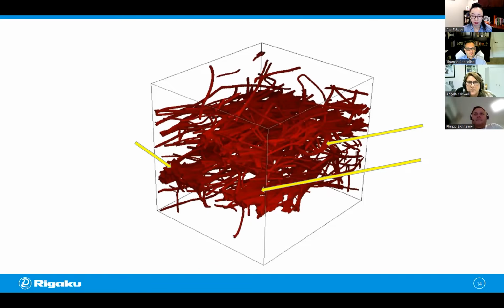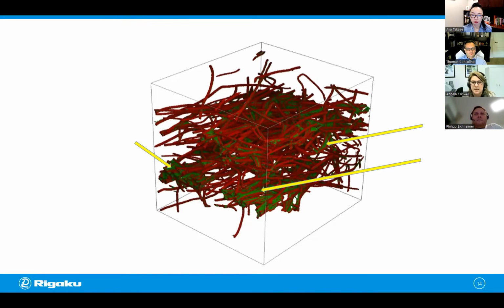So some of these fibers look pretty thick, and it turns out that this thickened area is called binder. And this binder material is often found in fiber media, and it serves important roles. So why do you think that some manufacturer might choose to add binder to fiber media?